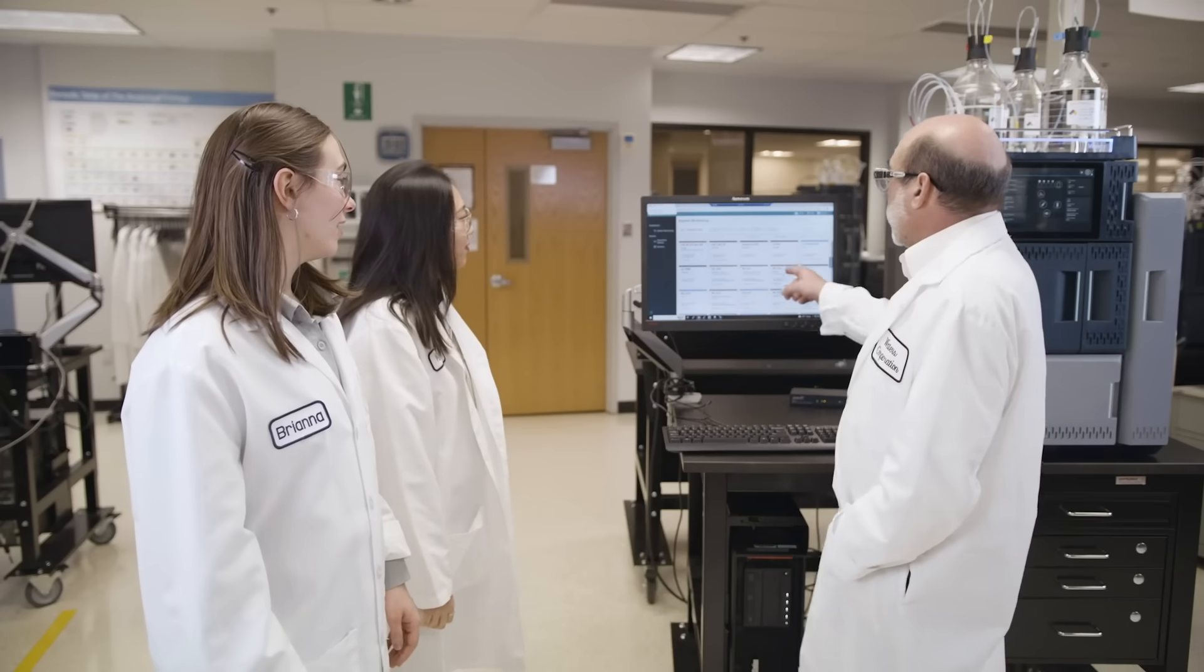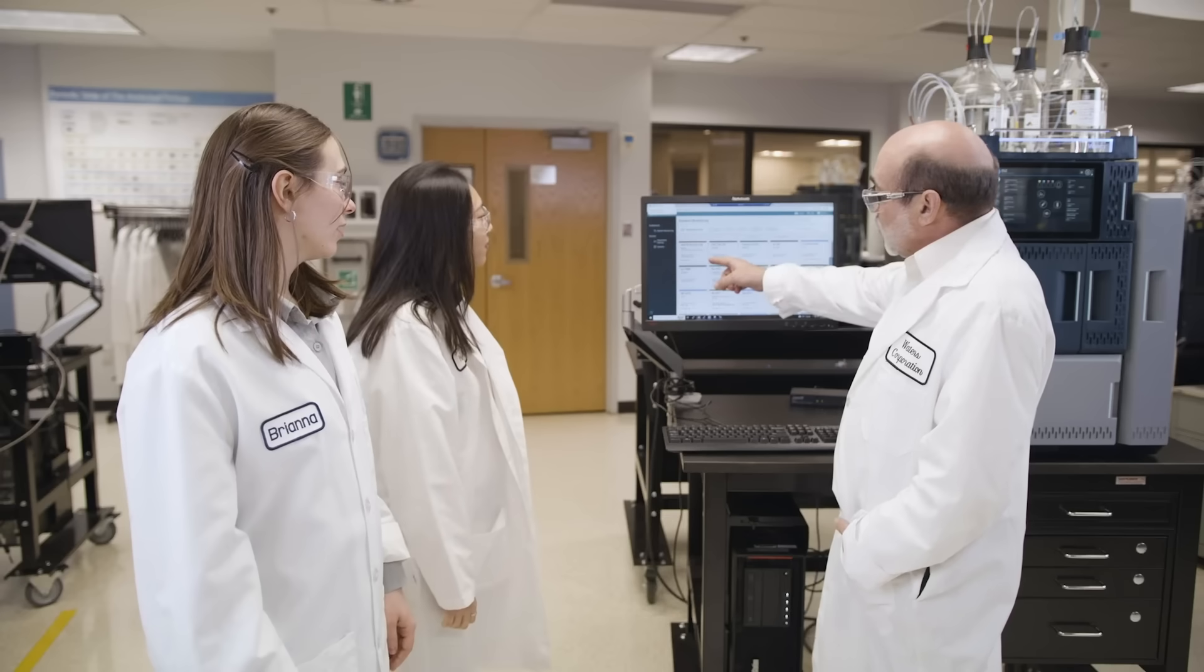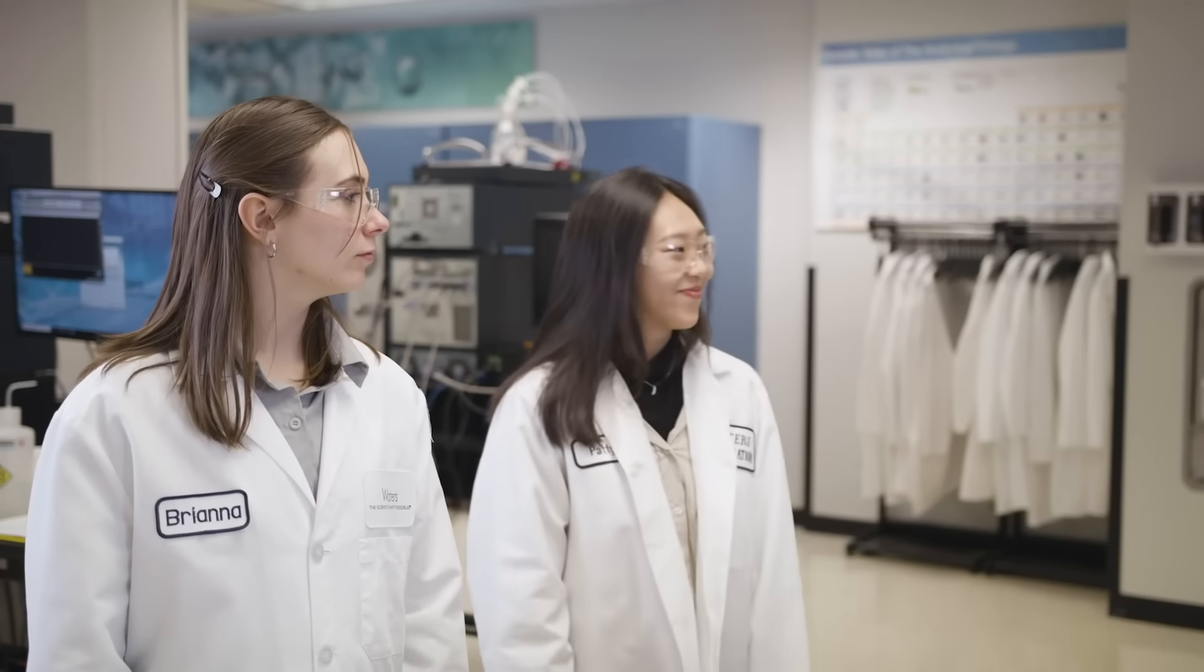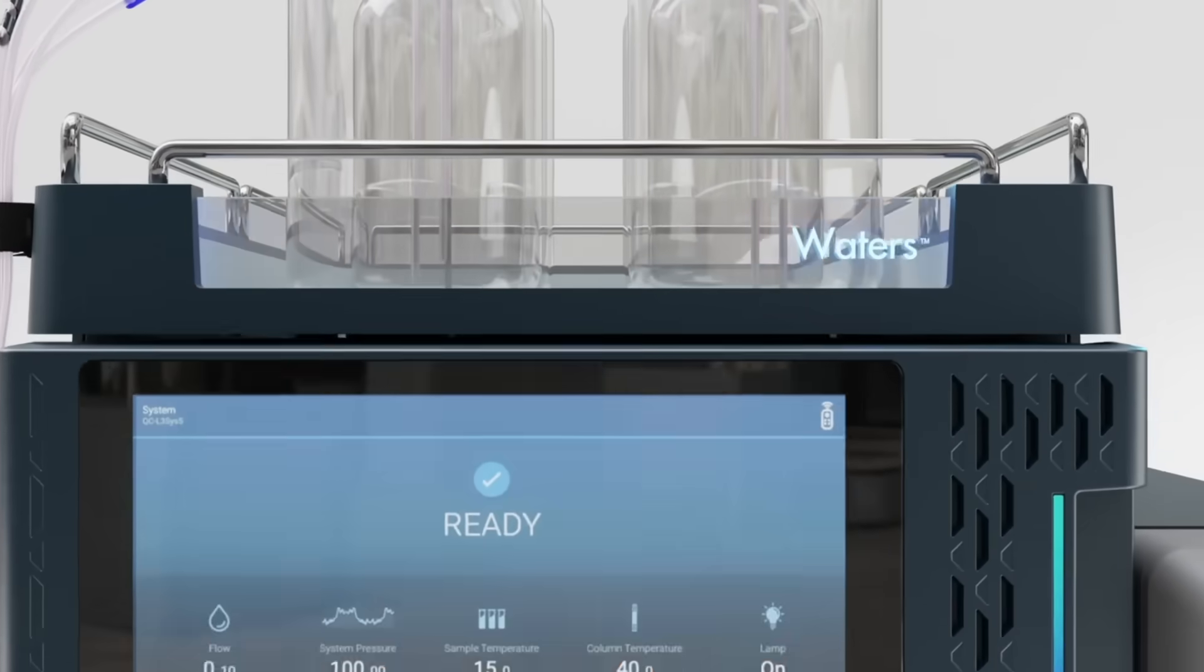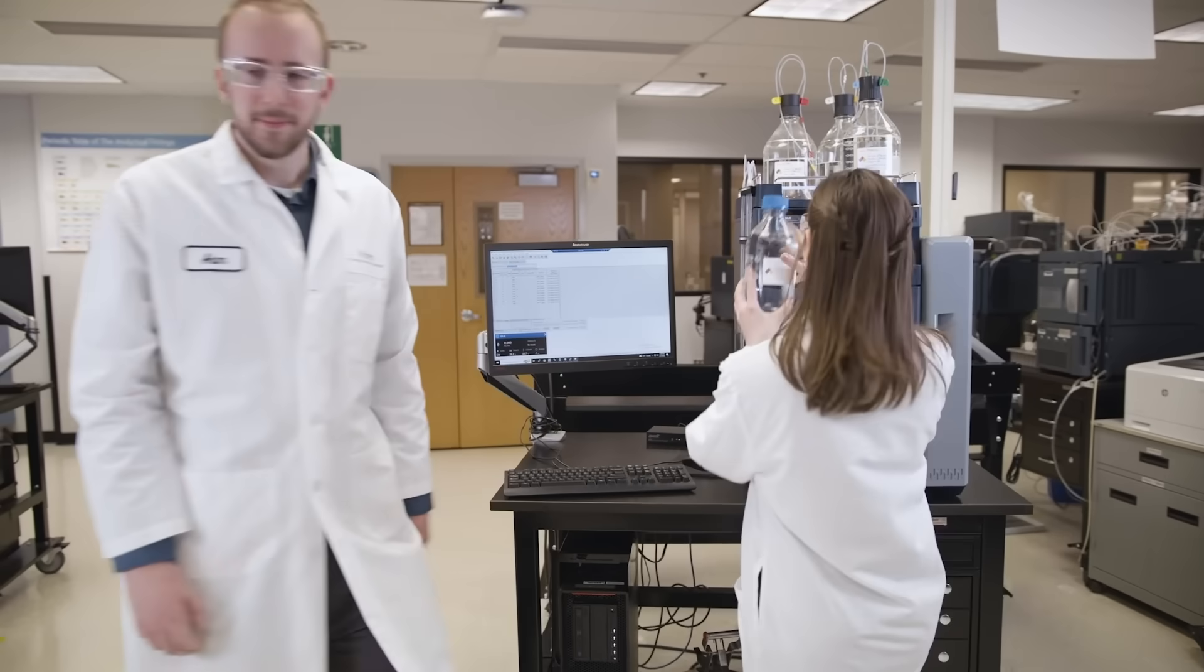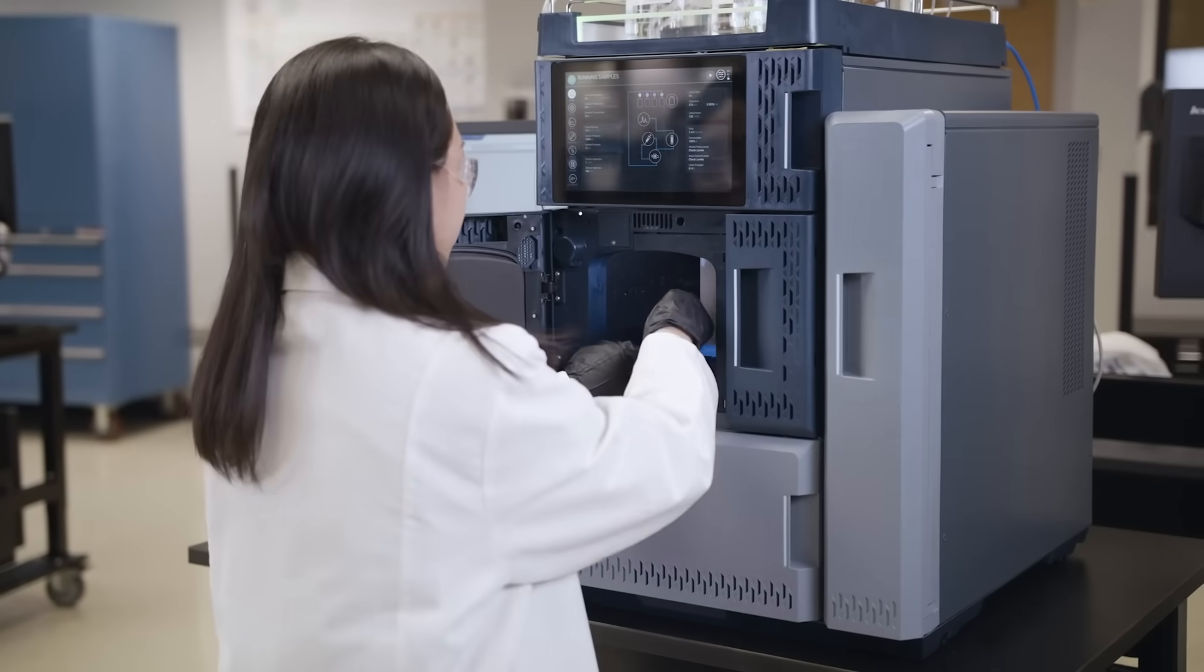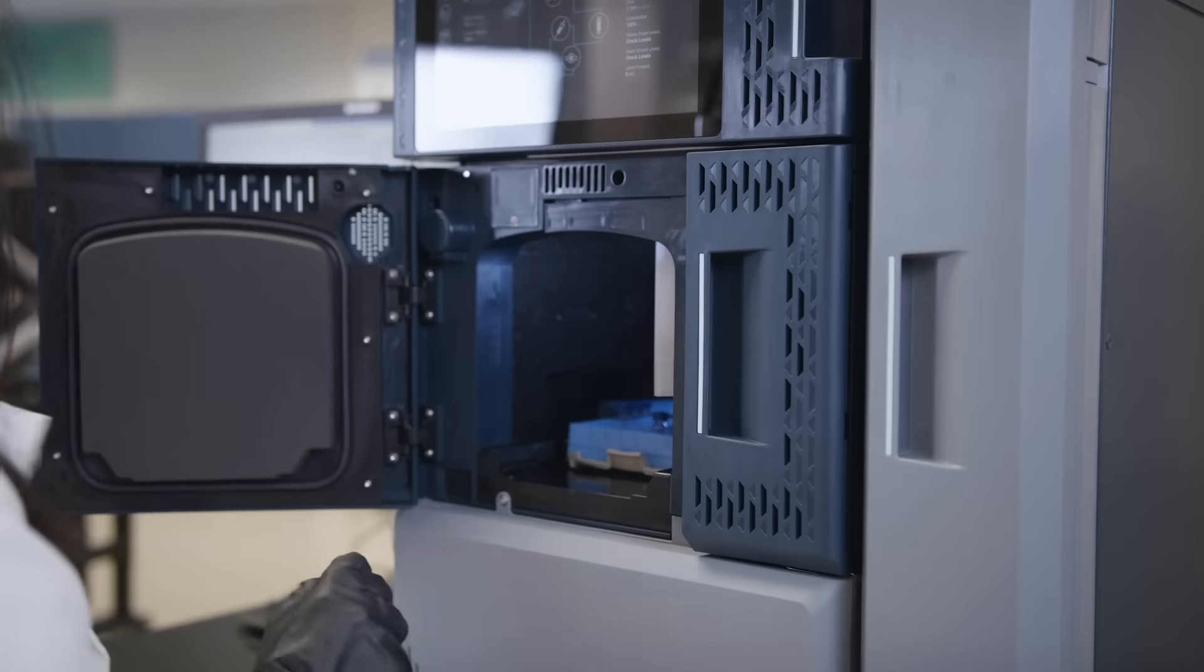As a member of the Alliance IS-HPLC family, the system is simple and easy to use and will quickly become an essential part of your lab's team. With error reduction as standard, the Alliance IS-Bio HPLC system helps prevent common errors, boosting productivity and reducing the risk of out-of-specification results.